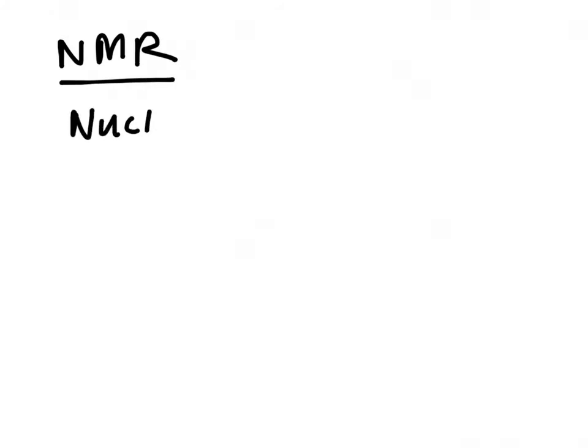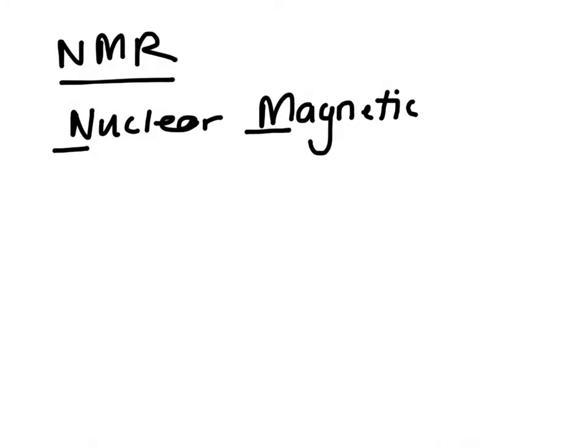So let's just start with dissecting what NMR stands for. It stands for nuclear magnetic resonance.